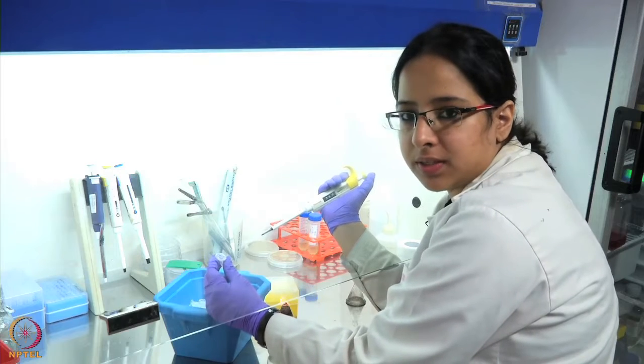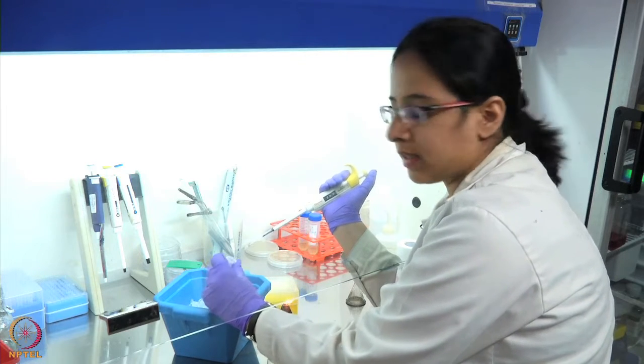This is our ligation mix which we will add in the competent cells.